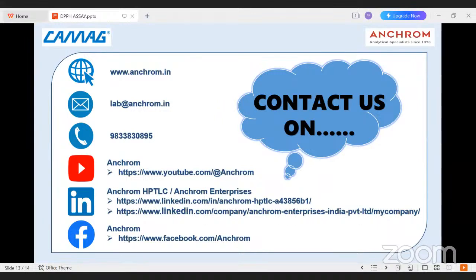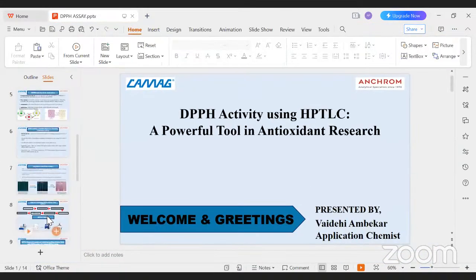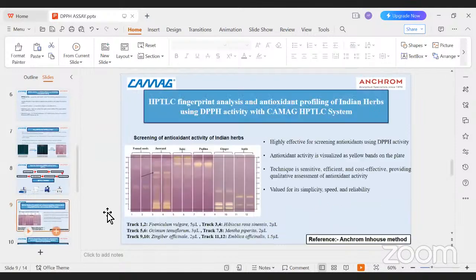Can you go back to that slide? You're talking about this slide, ma'am? Yes, the same sample spotted twice. Yes, ma'am, we have just duplicated the sample, just as replicates.